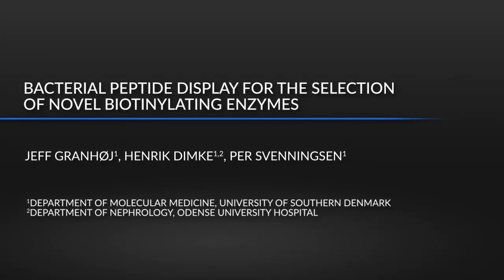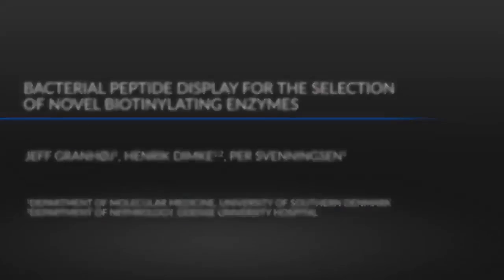This protocol provides a highly effective bacterial display system for isolation of novel variants of BirA that allows for specific biotinylation of native proteins. The main advantage of the technique is that it selects BirA variants using high-affinity streptavidin selection. This ensures that inactive clones are removed, thus creating a highly efficient selection process.